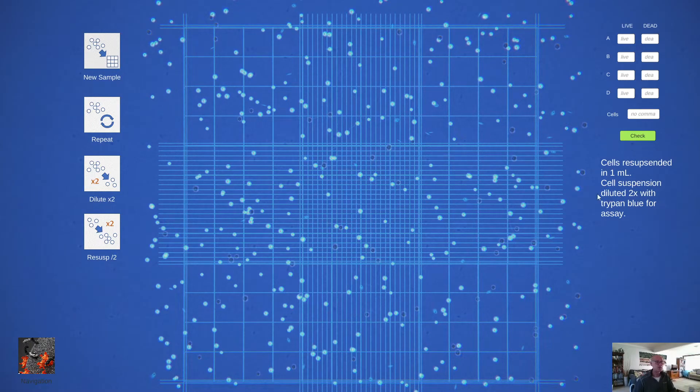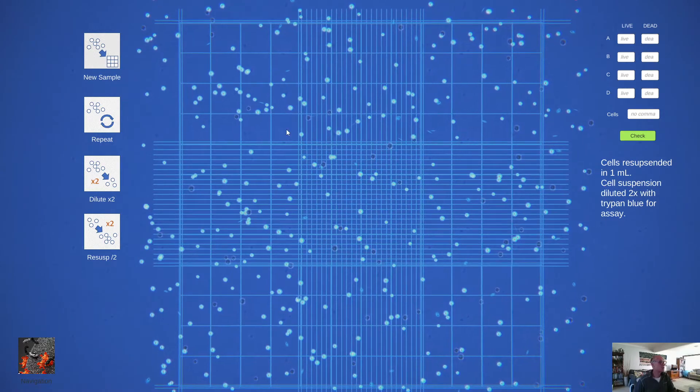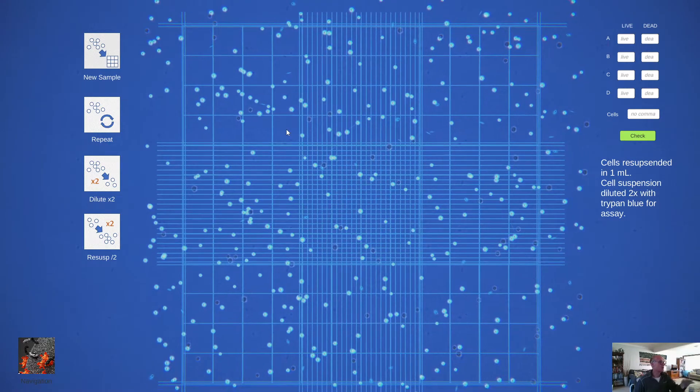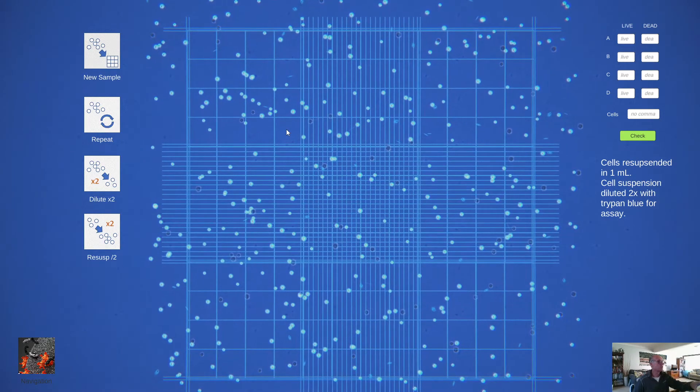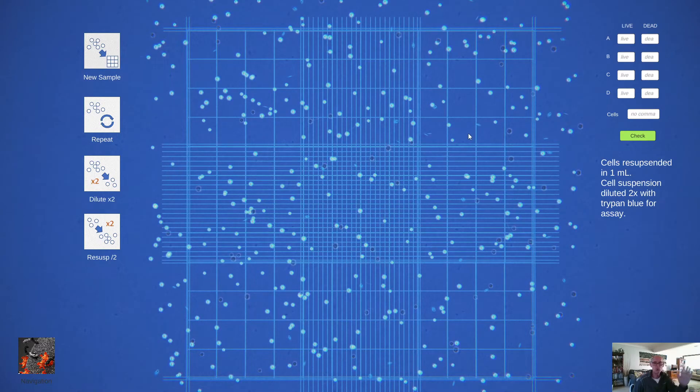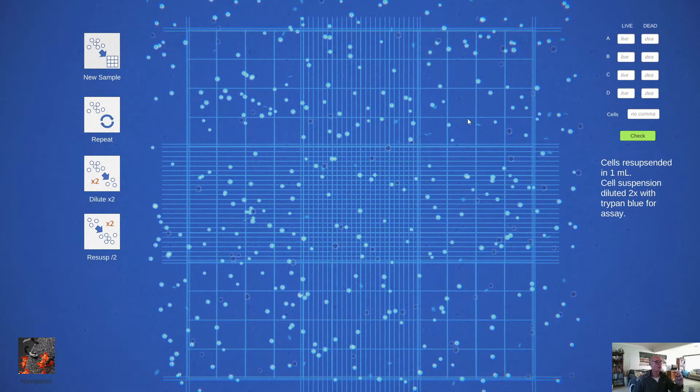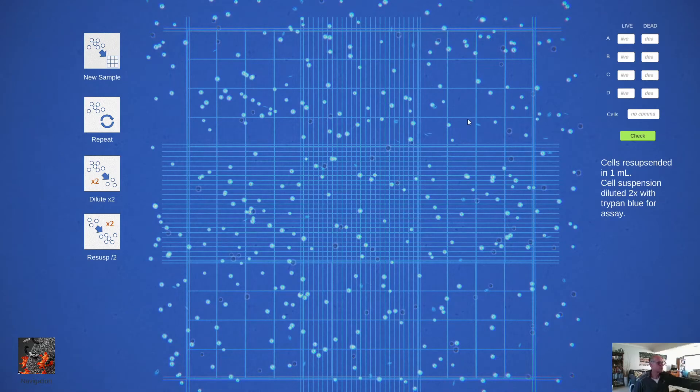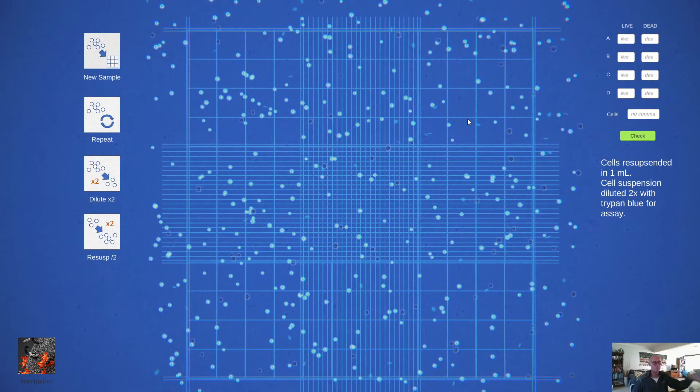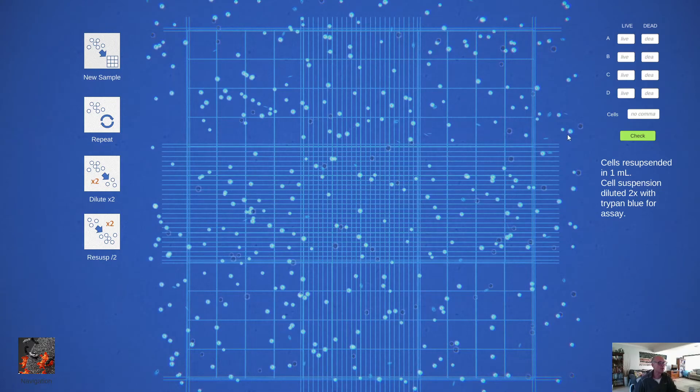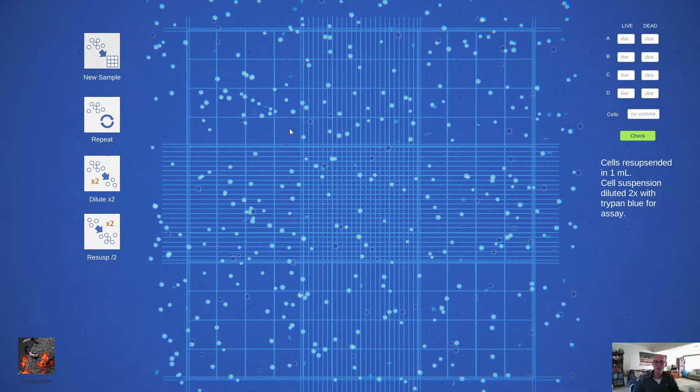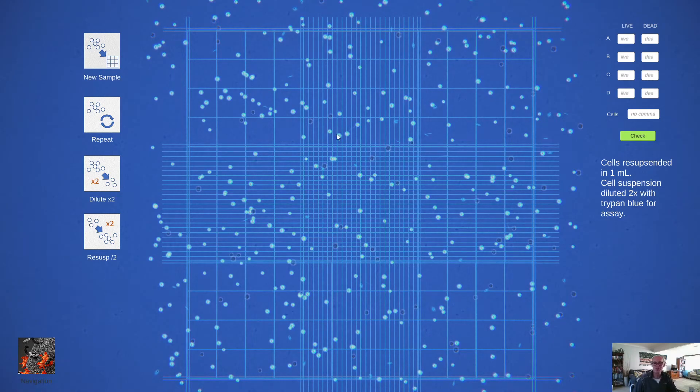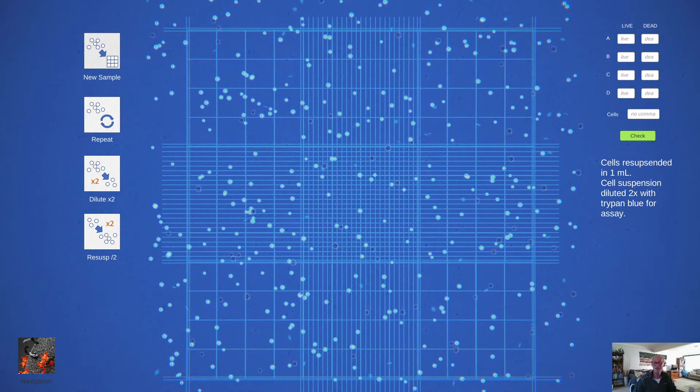That's a pretty nice implementation. There's some lovely graphics going on here, as you can see. There's this nice little swimmy effect. There's a vignette that gives a slightly brighter field in the middle. There's bits of dirt and dust and floaty bits all over the place. So you start to get quite an authentic rendition of what a haemocytometer looks like.